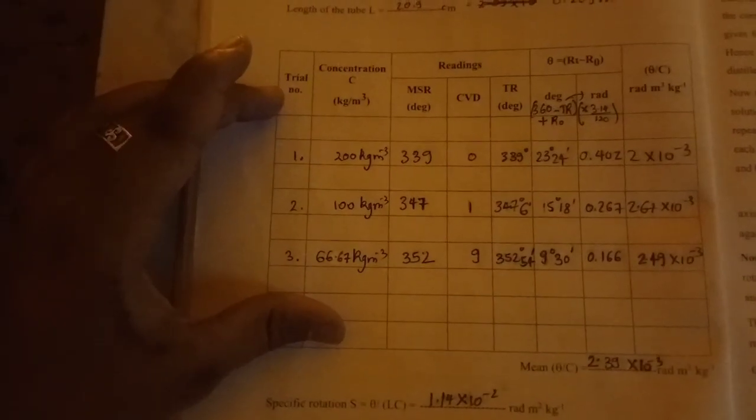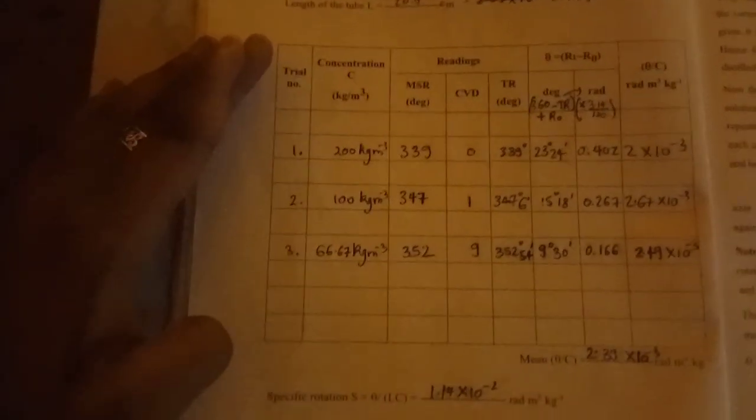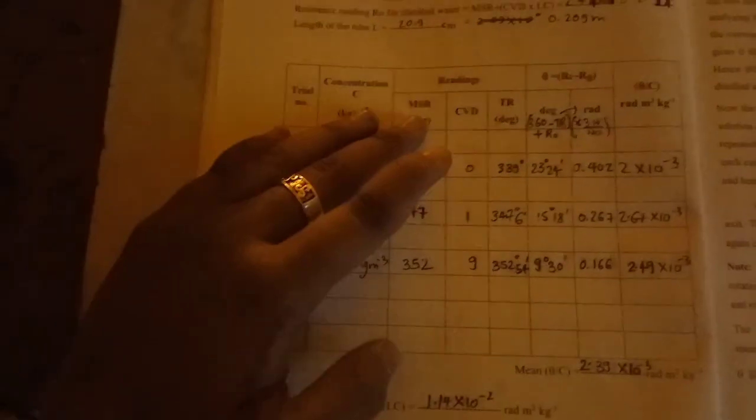Once you place the tube back inside the polarimeter, you will no longer see the two sides of equal brightness. So once again, one side will be darker and one side will be brighter. And this time again, you have to rotate the tube. So you will be rotating the Nichol prism once more. And this time, because the concentration is decreasing from the previous one, you'll be rotating clockwise.